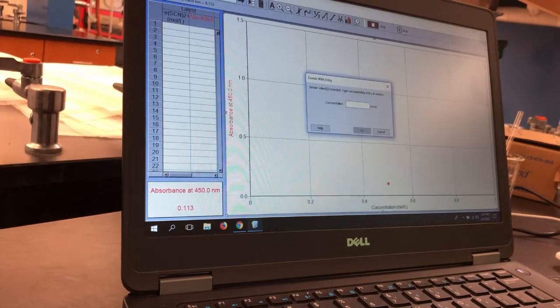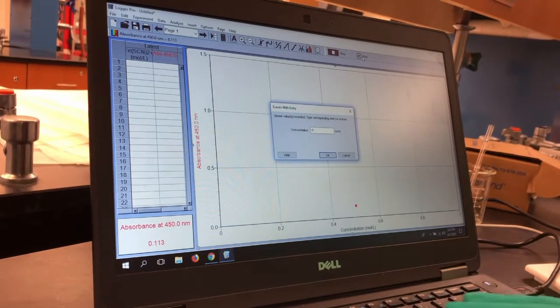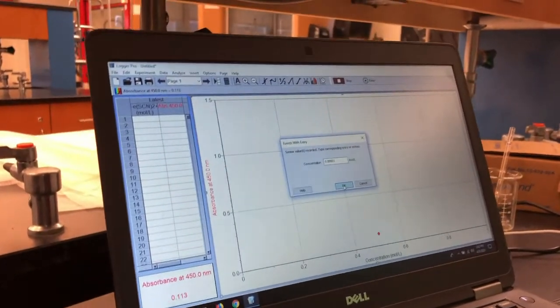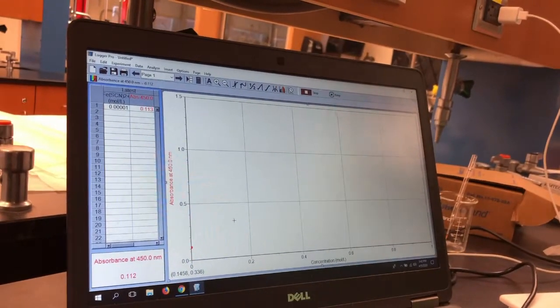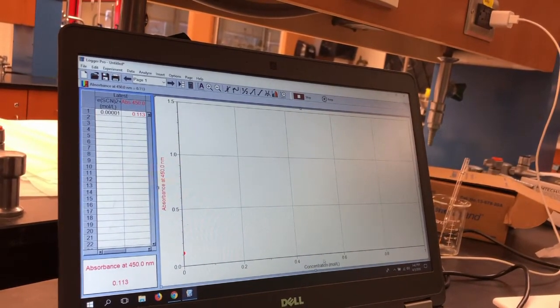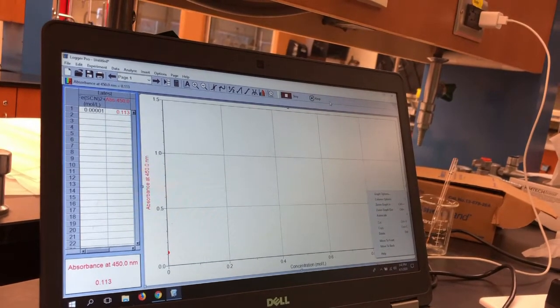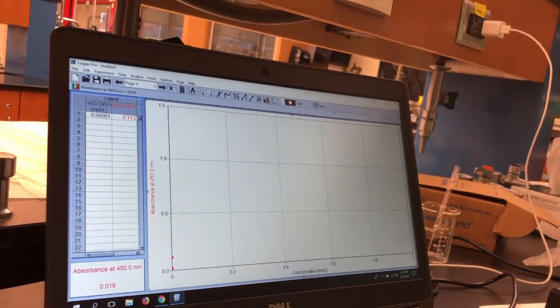You've gone ahead and calculated your concentrations. So this one is going to be 0.00001. And we'll push OK. And there I'll have this plot. So this is what's going to create our standard curve. Now mind you, our axes are a little wild right now because our concentration is very dilute. So what I can go ahead and do is change this, once I'm done with the collection, to see that nice calibration curve.